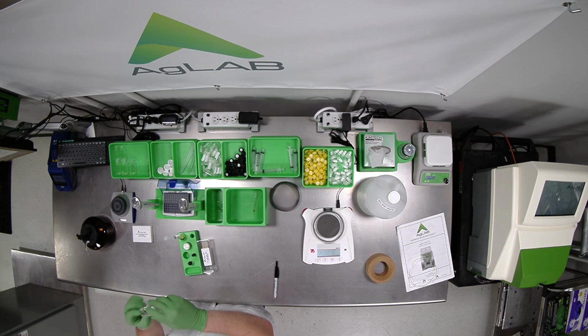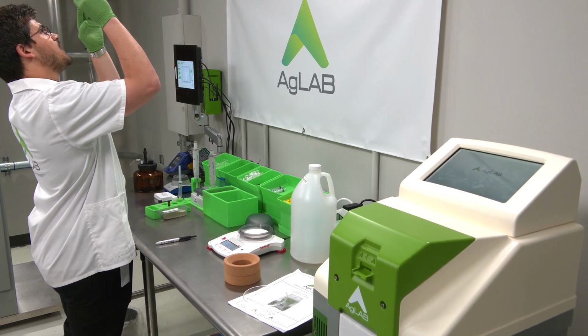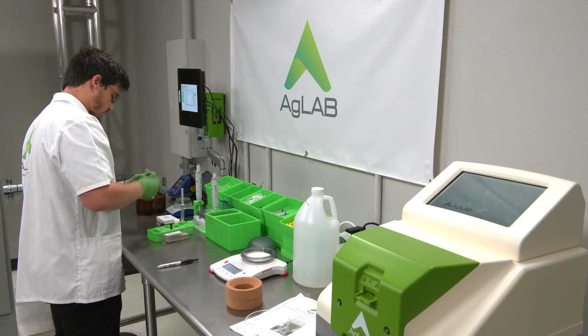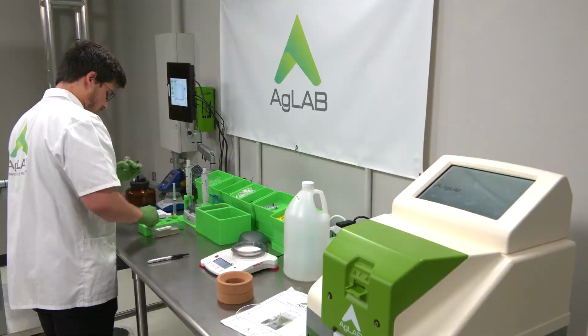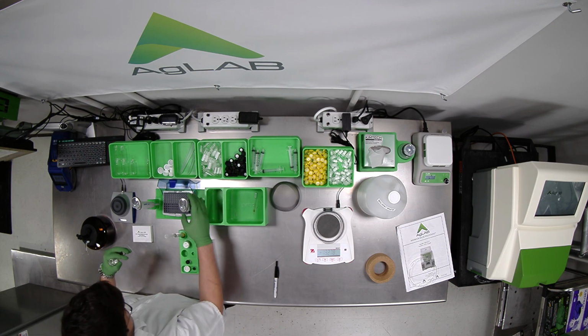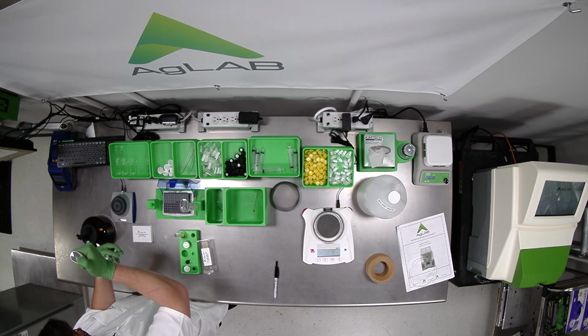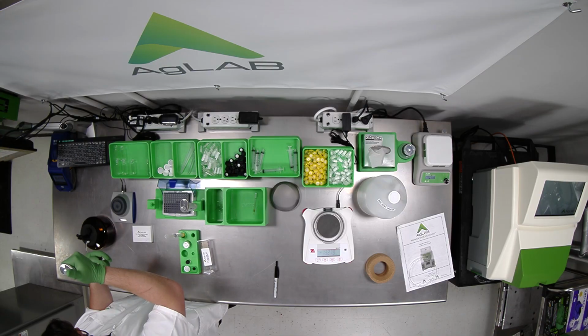All right, so these head samples go into solution very easily. I just do a little visual check here to make sure I don't have anything floating. Looks fine to me. So now we have our vial D1 in solution. We're going to take our D2, which is our internal standard, and we are ready to make our second transfer. So for this part, I will dip the tip right barely under the solution line in there. And then I'm taking it over to my D2 vial.